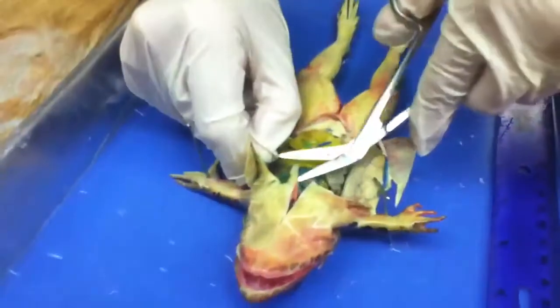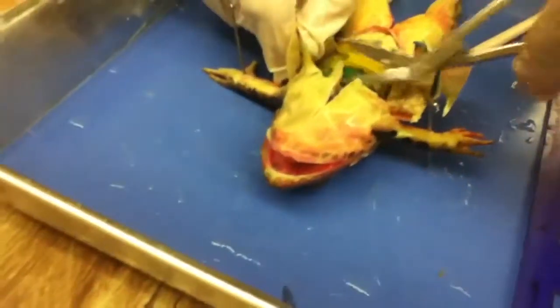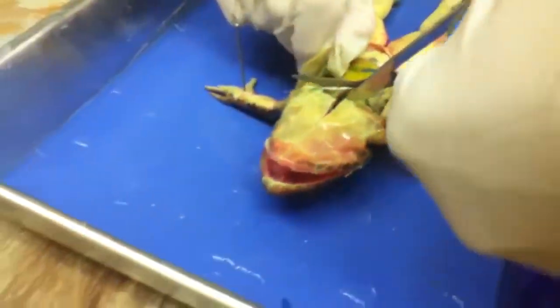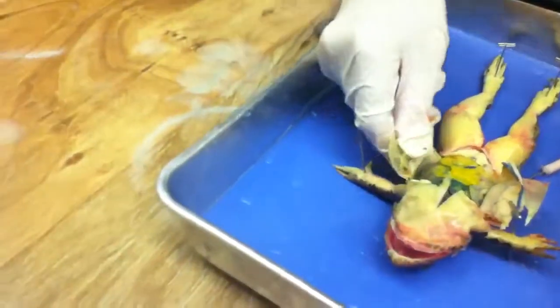Here's his sternum if you look at it. What's a sternum? The bone right here in your chest, the one that holds your ribs together. Oh, yeah. Alright, so pin it down. Two pins.